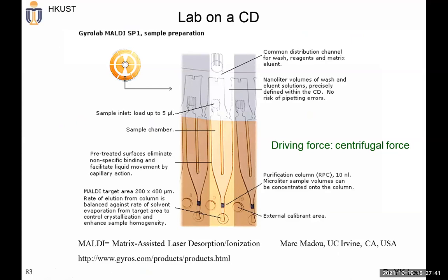Lab on CD is another interesting idea: you make microchannels in a CD or DVD, then use a micromotor to spin it at different angular velocities. The inertial force pushes the liquid sample through microfluidic flow, and sometimes you can do separation analysis. This is quite important.